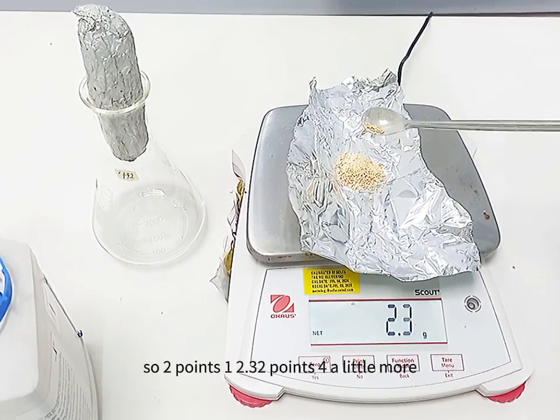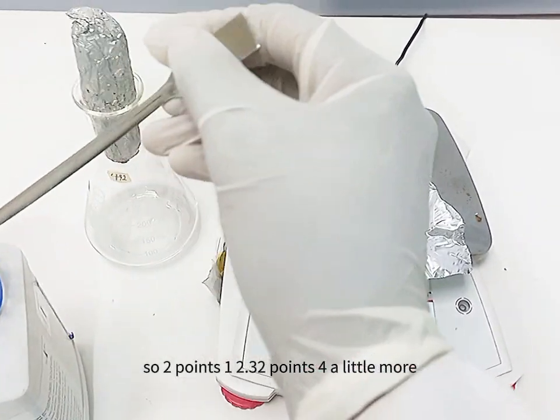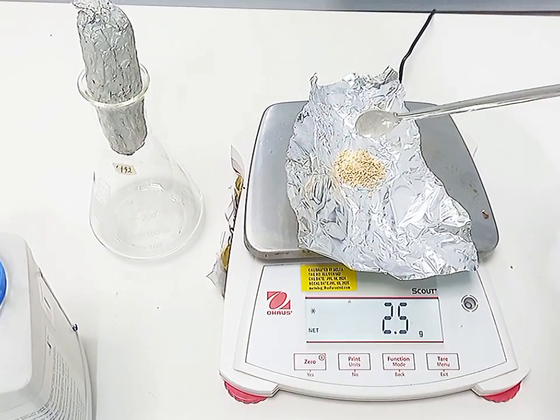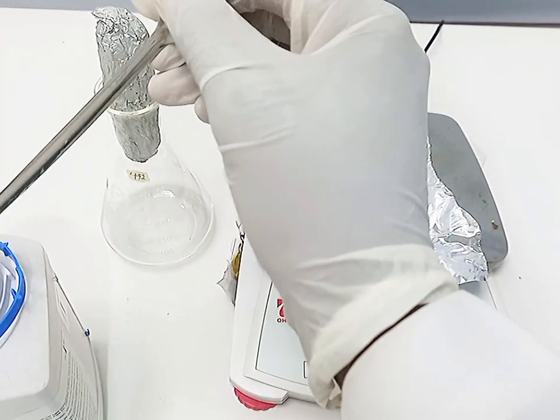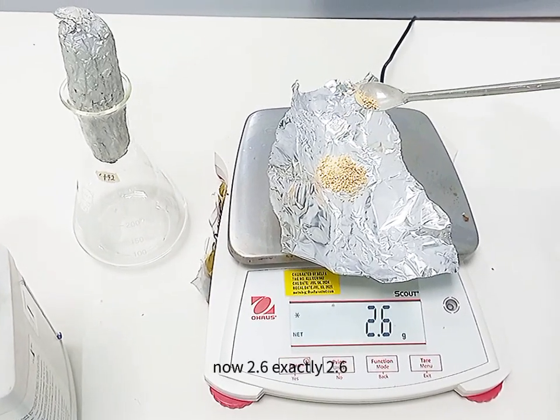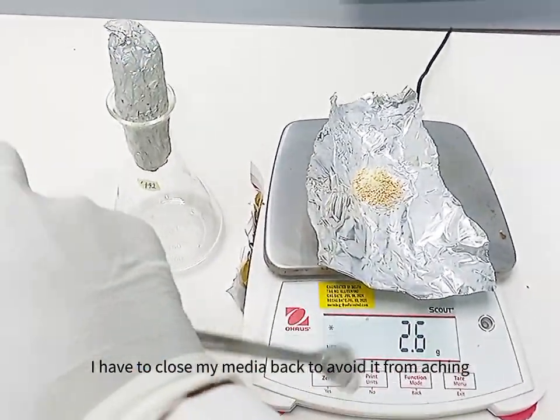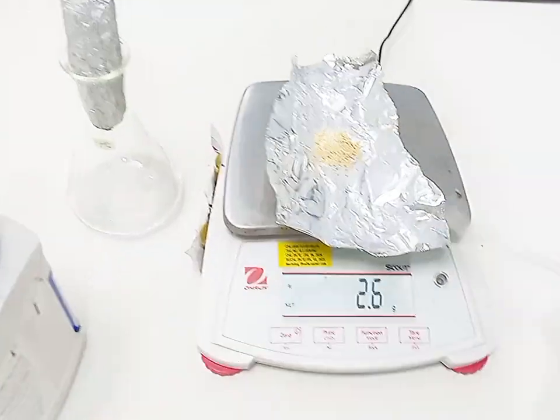So 2.1, 2.3, 2.4, a little more, 2.5, a little more, 2.6, exactly 2.6. So I have to close my media back to avoid it from caking.